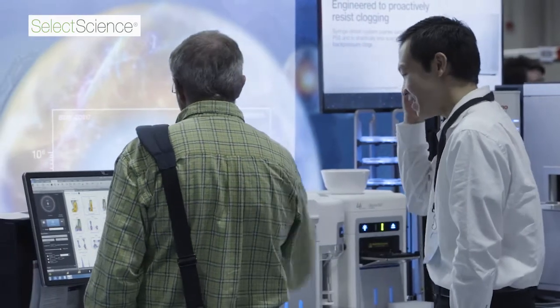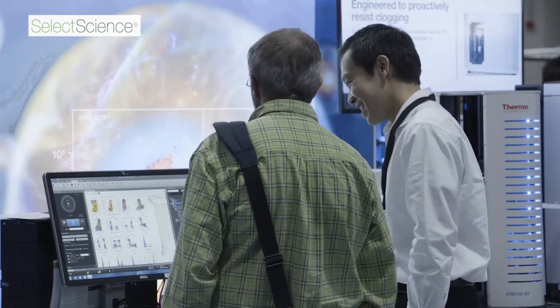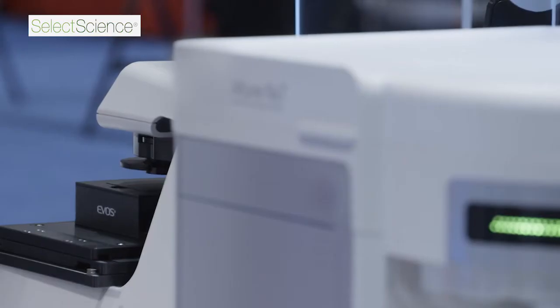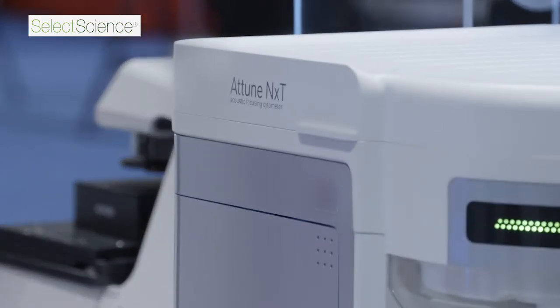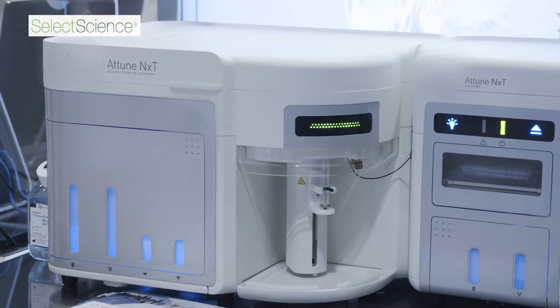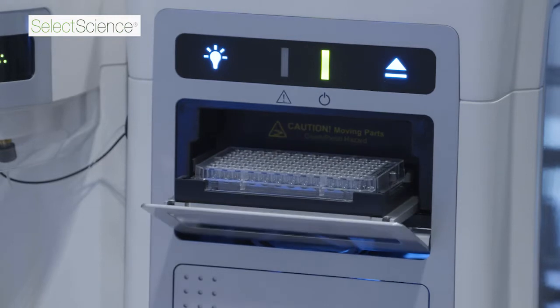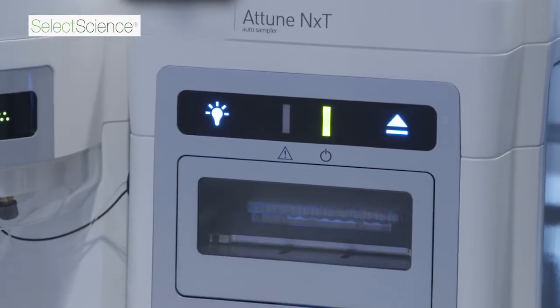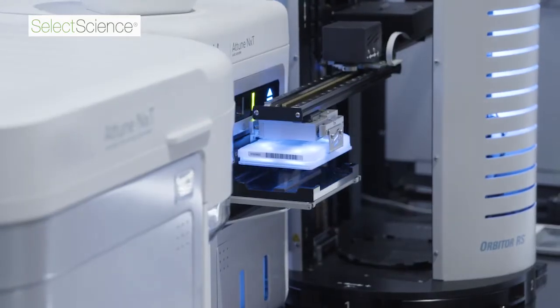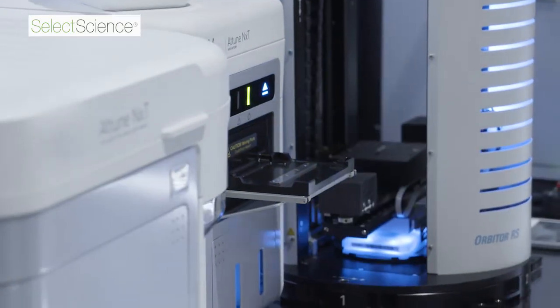The flow cytometer, which uses a series of lasers to get information about the bacterial cells, to look at the drug's effect on individual bacterial cells. We use the Attune NxT, which is an acoustic focusing flow cytometer from Thermo Fisher Scientific. We've chosen this one because it has a particularly strong resolution on small particles and is used to rapidly analyze samples either in pure culture or directly from clinical samples.